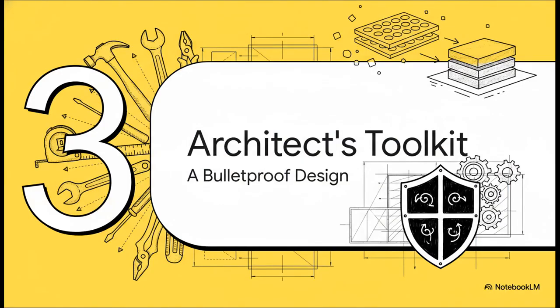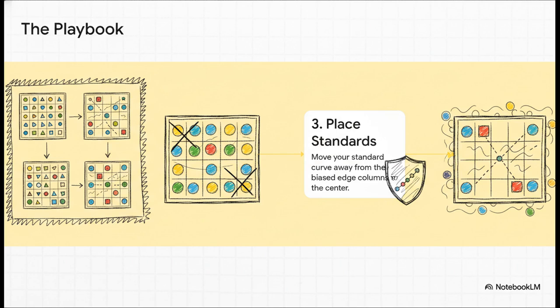So let's open up the toolkit. I'm going to walk you through 4 core principles that will literally transform you from a simple kit user into a true assay architect. Someone who can build a completely bulletproof experimental design. All right, here's the playbook. 4 simple steps. First, block your design.